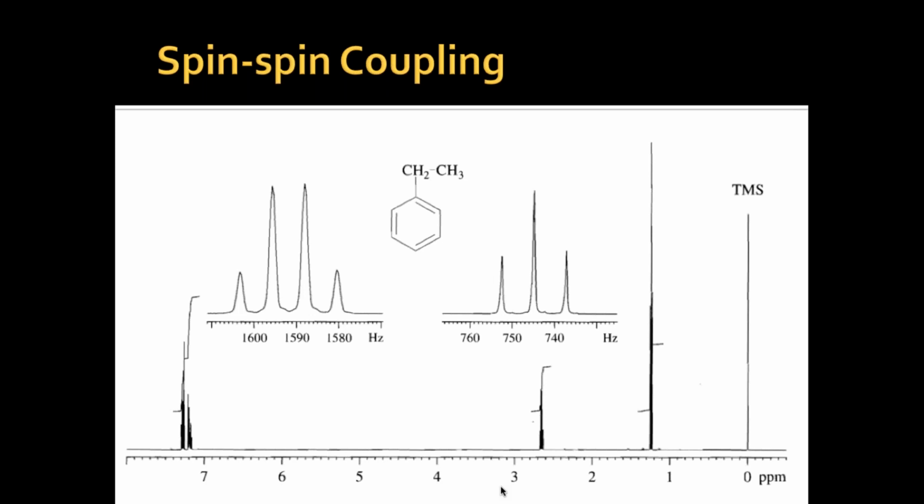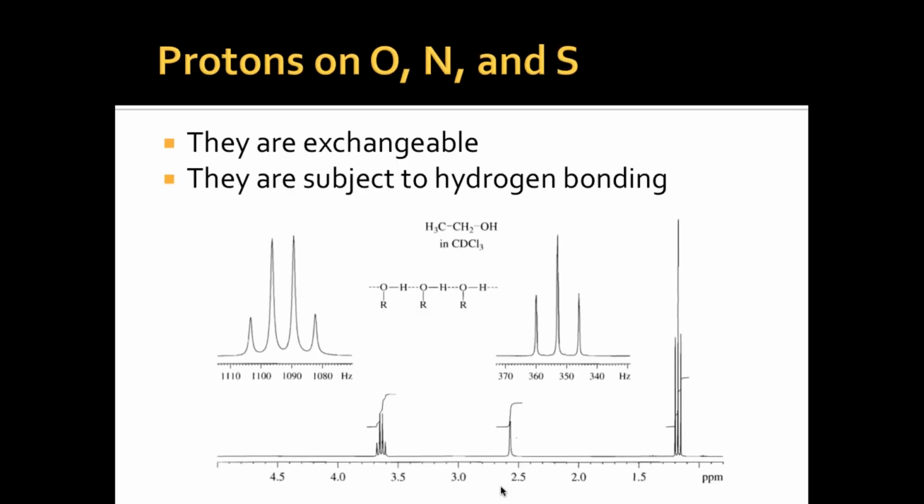The CH hydrogen is not under the influence of other electrons, but OH, NH, SH, all those hydrogens are under the influence of other electrons, as well as the electronegativity difference between hydrogen and those atoms. The electronegativity difference between carbon and hydrogen is also there, but not as much as with oxygen, nitrogen, and sulfur.